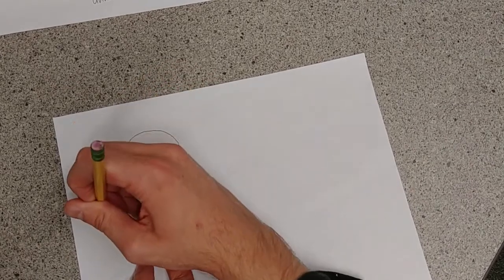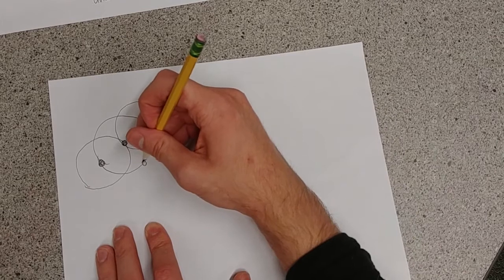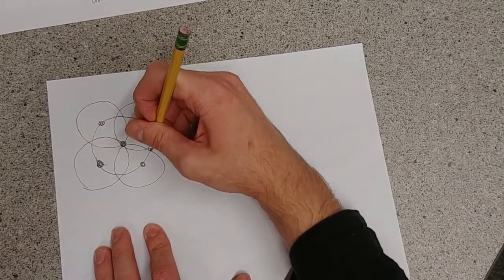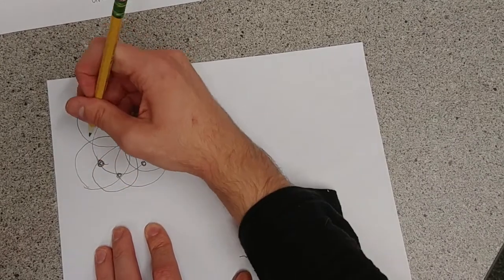And what that moiré pattern looks like is actually three dots in Fourier space. And around each of those dots is a concentric circle representing the low-pass filter in that space. So, each of those line patterns has a low-pass filter, and the moiré fringes that we see have a low-pass filter. So, you can see that increases our area.